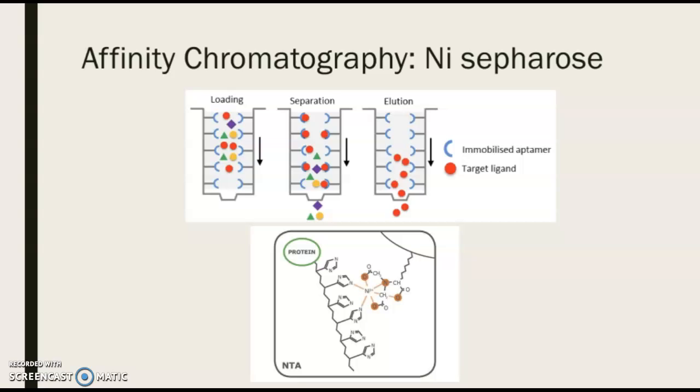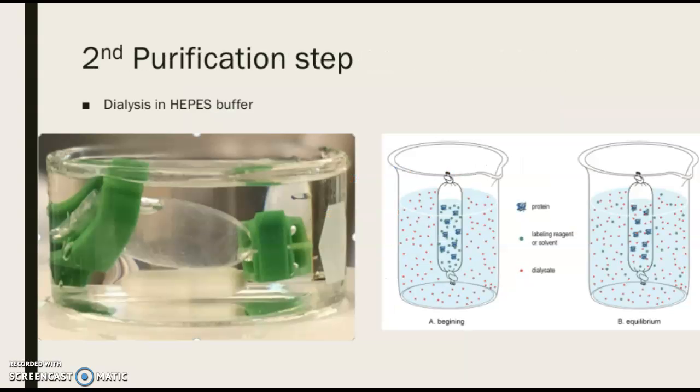The elution stage is when we wash with the PBS and the imidazole, which causes our protein to unbind from the nickel column. These fractions are saved and are considered to be potent in our desired protein, but not pure because it's still bound to the His tag and possibly other things. Our next step is dialysis.